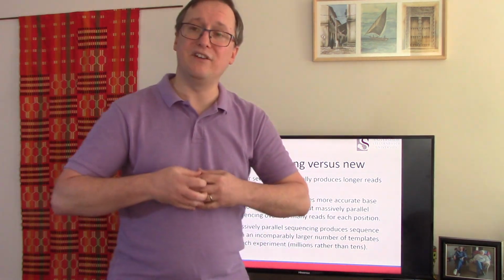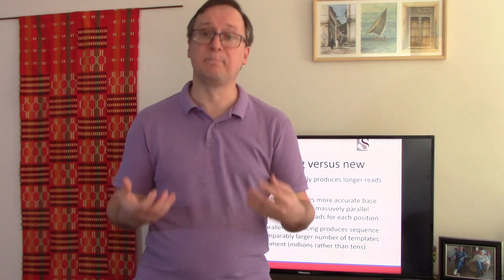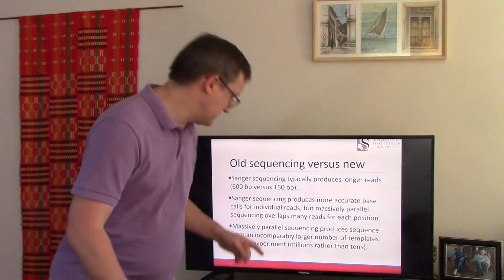by having hundreds of reads at a particular position, you are able to get a very great deal of confidence about what each nucleotide in your template really was, because you have so many sequences covering that. So having a lot of reads helps to compensate for the fact that per base call confidence is a little lower in today's sequencers.